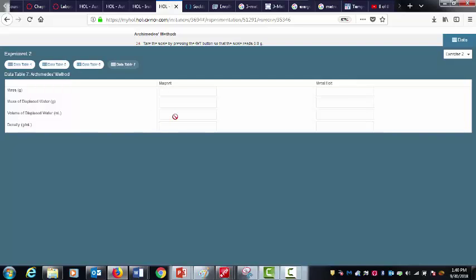So your displaced water volume, just to be sure, is going to be the difference in mass between the mass of the water on the scale and the mass of the water once you added the magnet or the metal bolt with the string. So that difference is going to be the mass of the displaced water, which is equal to the volume of the displaced water.